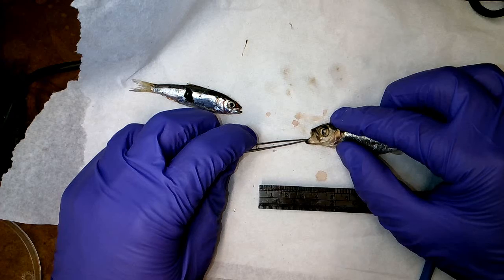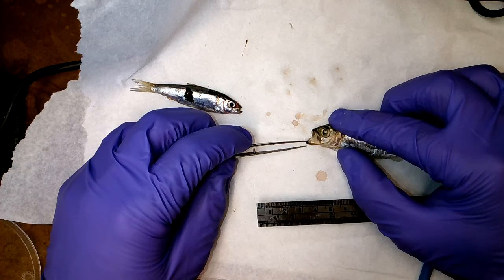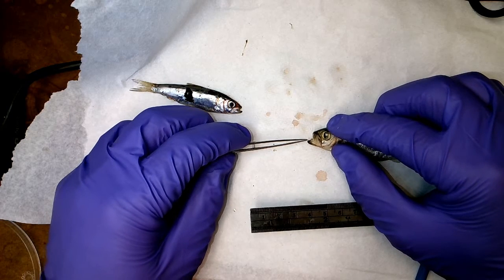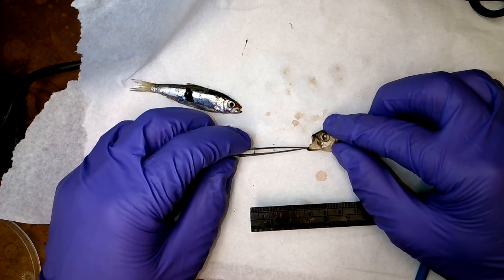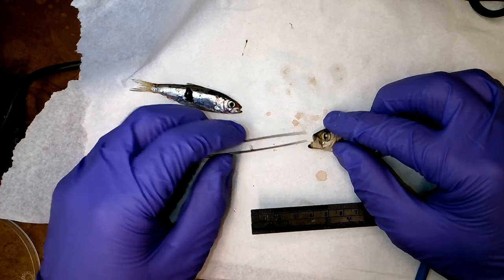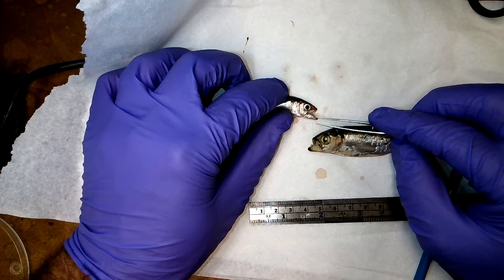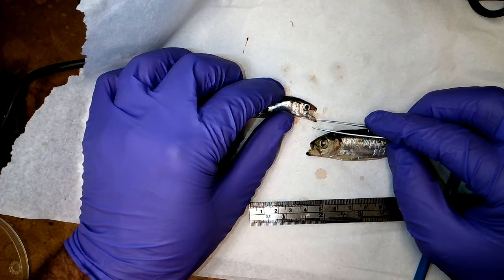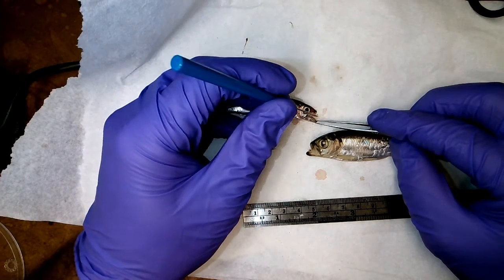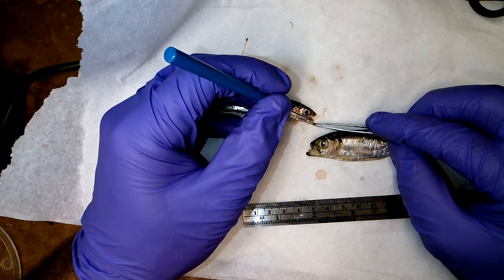What we want you to do is open the mouth and look for that tongue. Again, not changing the angle of the fish, just have it lateral to you or broadside, and open the mouth and look for the tongue. And is it protruding past this V opening here in the mouth? Okay, that one isn't, in my estimation. And if I open this mouth, again, more hands would be helpful, but if I open this mouth and use this other tool, the tongue's dragging down with it. But so there's the tongue.